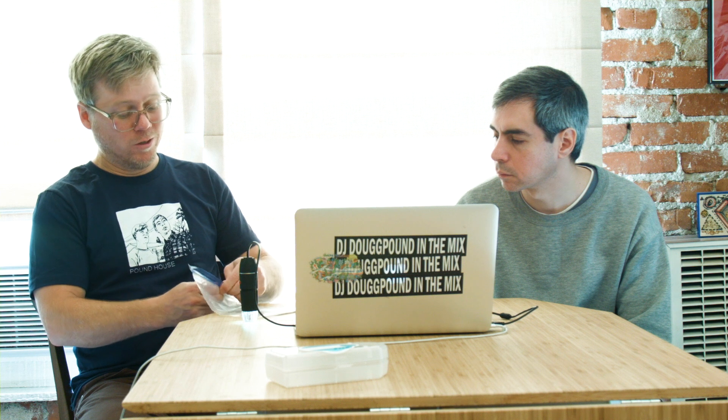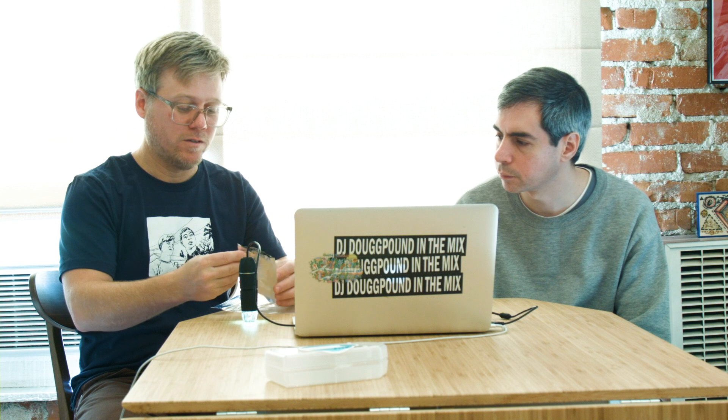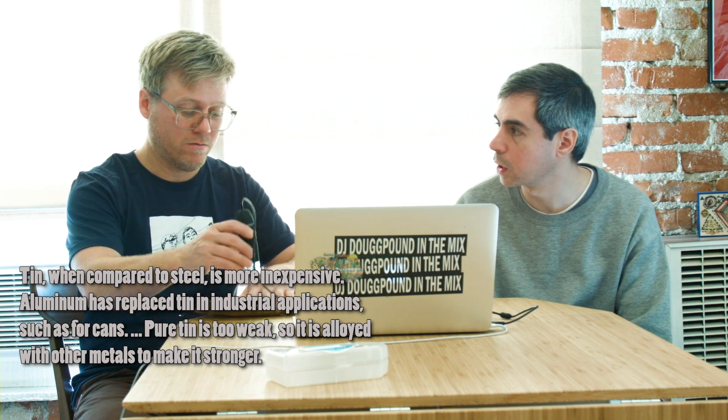Well, it's not really tin foil, it's aluminum foil. But maybe back in the day it used to be tin. The original. What even is tin? Is anything made out of tin anymore? That's my question. Roof sightings.